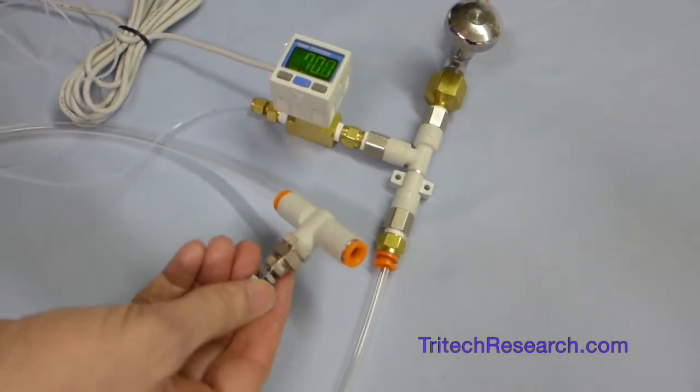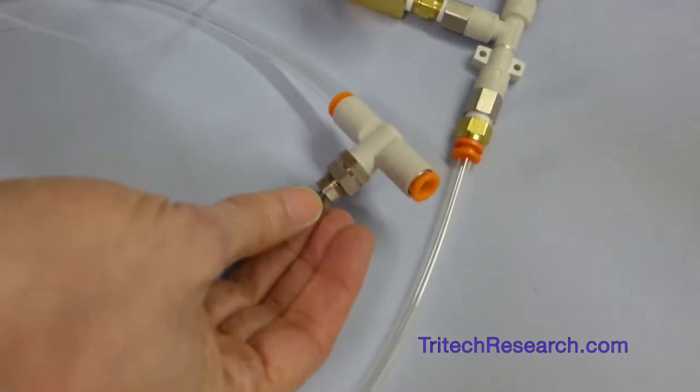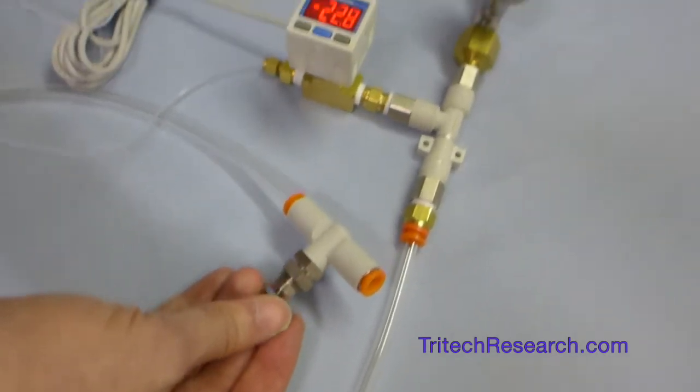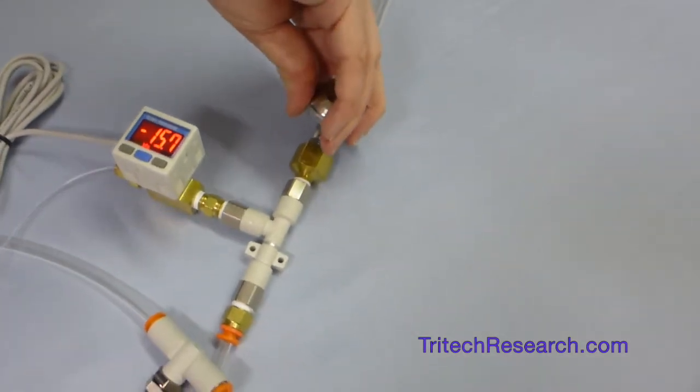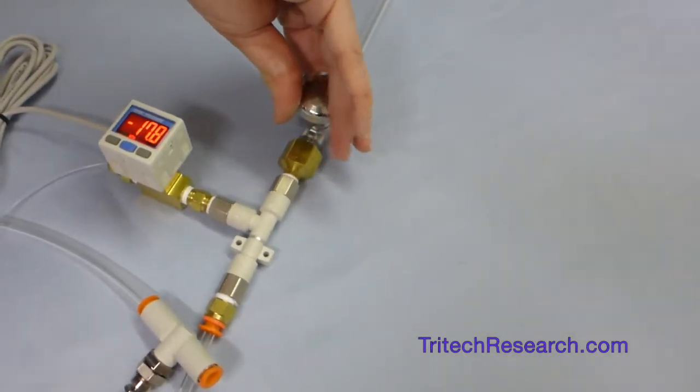So by adjusting this valve here, we can go from positive to negative pressure. And we can also restrict the flow here if we don't need a very strong negative pressure.